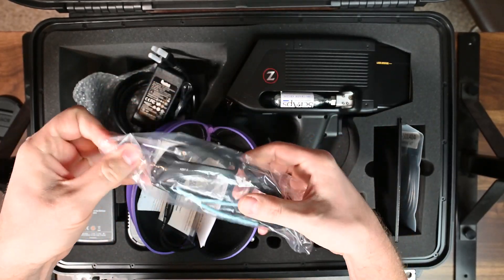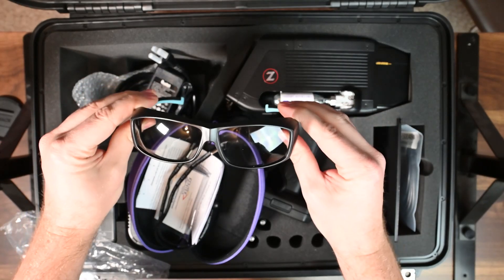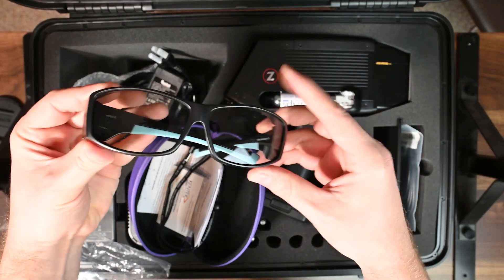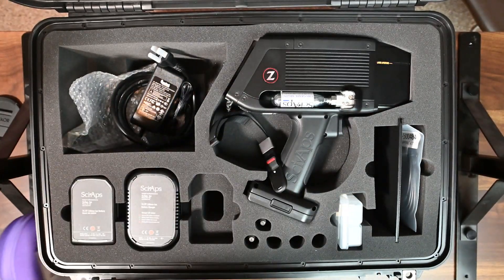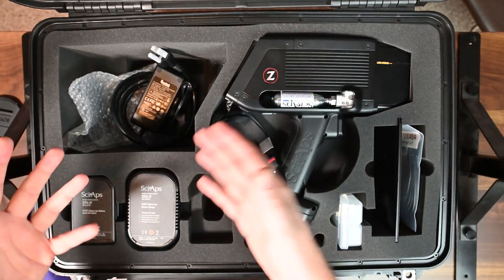These here are another important feature — the laser safety glasses. You can purchase more of these if you want, but it comes with one standard pair. These are designed for the specific wavelength of light that the laser emits in this unit.